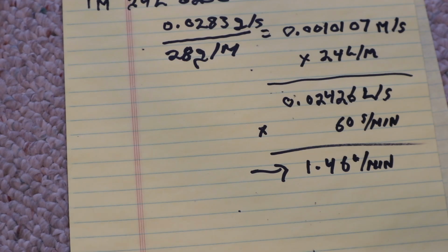If you have a giant cryocooler cold head, and let's say it has 100 watt lift capacity, so 100 joules a second, you can figure out what your feed rate is very easily doing this, so you know how much you need, so you don't condense the gas so quickly that you run out of gas and create a vacuum and suck room air in.